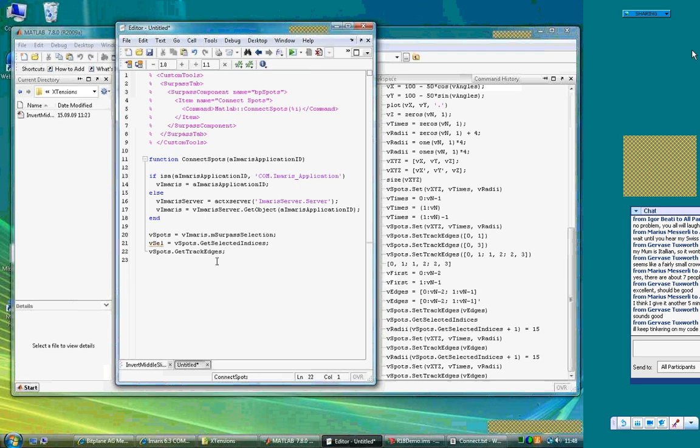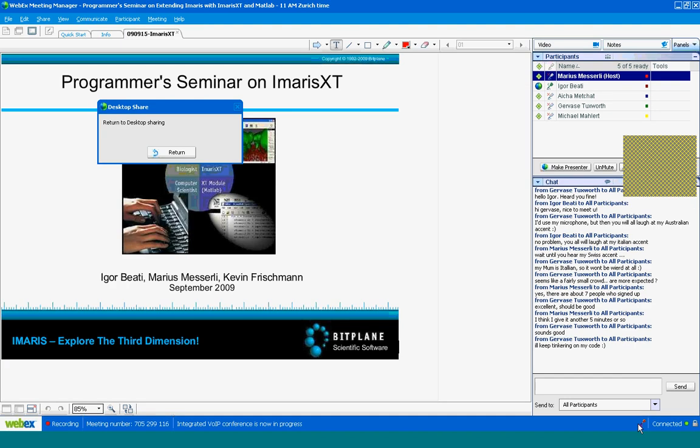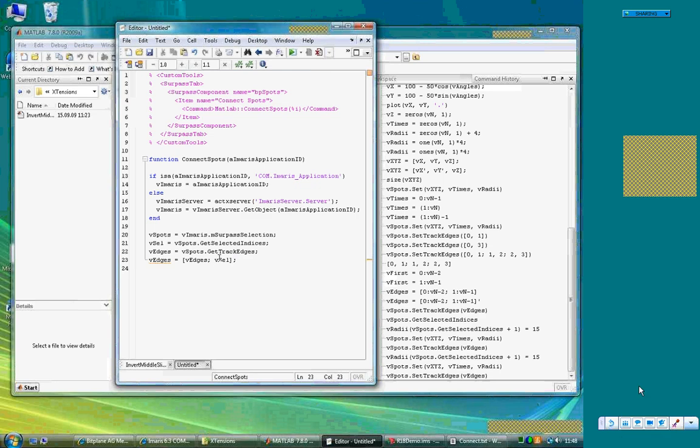we save them, we add a new edge concatenating them with our selection. But here we see they must be 2, so add one test.